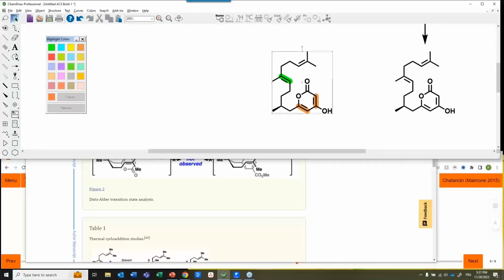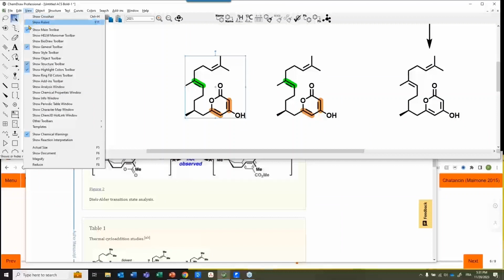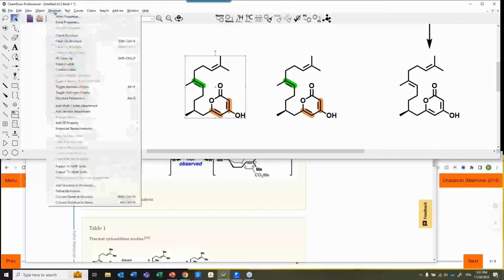First of all, just take this. I'm going to make a copy again. Control-Shift-D, or this icon in the structure toolbar. So structure toolbar again is View menu, Show structure toolbar, and the icon on the right is the 3D cleanup. You need ChemDraw Professional for that.